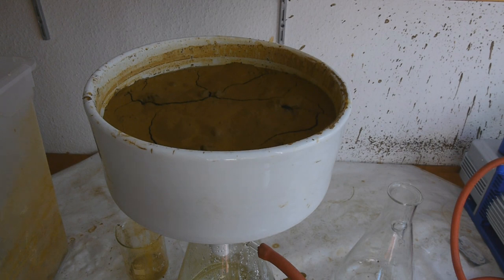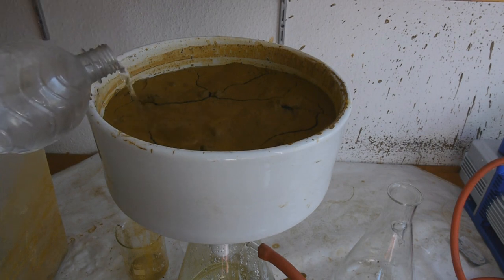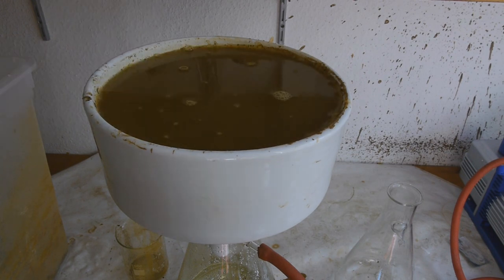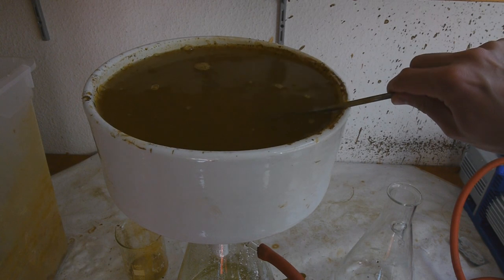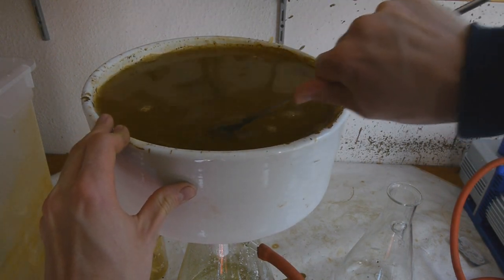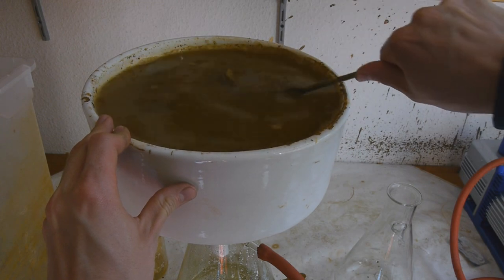And now we just need to wash this with a lot of hot tap water. So let's just add as much as I can. This turns out to be about 1.5 liters. And now let's stir this up again to make sure the water will be used as efficiently as possible.